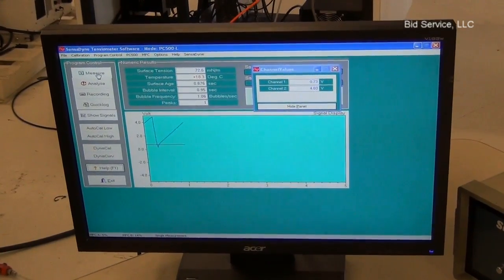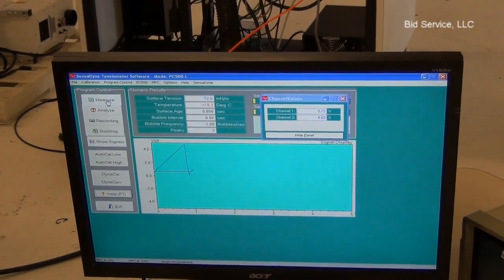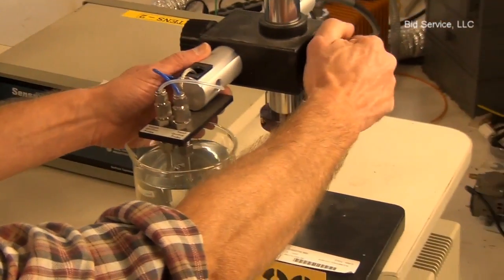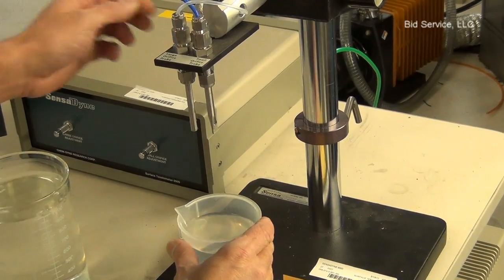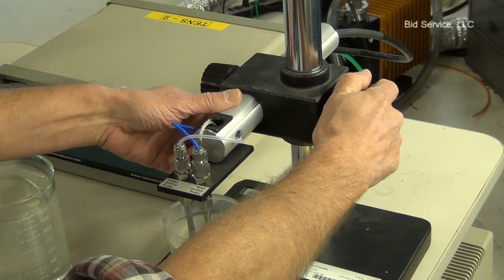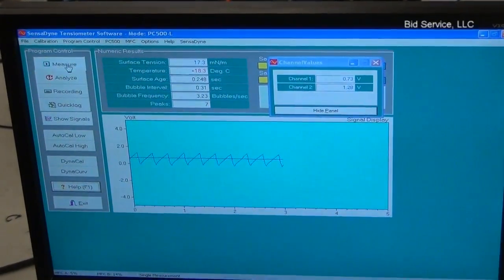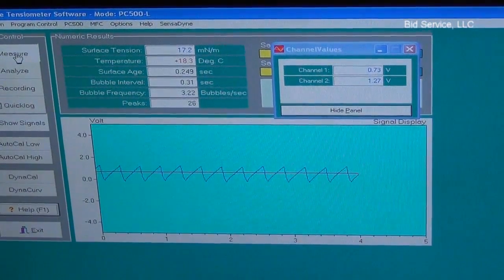You hit measure. Here we have water and we're measuring roughly 72.7. I'll change out the water for the alcohol just to show there is a difference in the readings. You can see the sawtooth wave is smaller here with the alcohol, and we're getting a reading of 17.3.